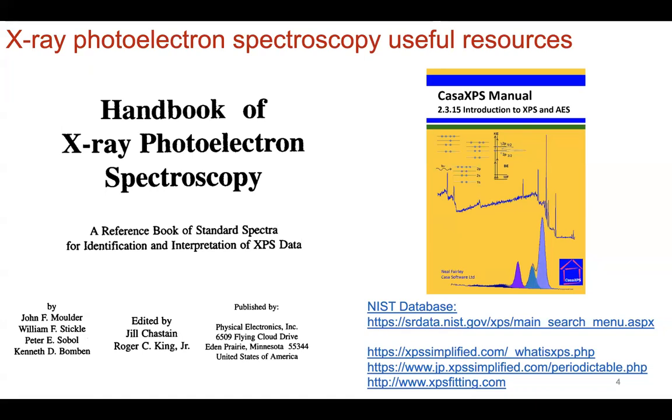And the last three resources are really good primers, particularly for different elements. So if you're working with a new compound or new to you, and you're not familiar with a particular binding energy or the spectra that's typical of these elements, this is a really great starting point so that you don't have to go into the weeds if you don't need to. It's a really good introduction for different elements. So XPS simplified and XPS fitting are two really good starting points for that. So you have surfacey and also more detailed information for later on.